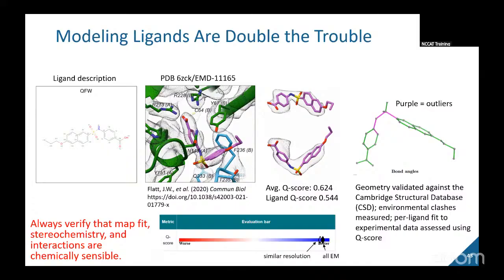I spent countless hours staring into the druggable pocket. I tried doing MD, these cryo-EM guided simulations, all sorts of tricks to try and refine the pose, and I didn't end up at a perfect solution. And I think it was mostly the elbow region that was giving me a lot of trouble.